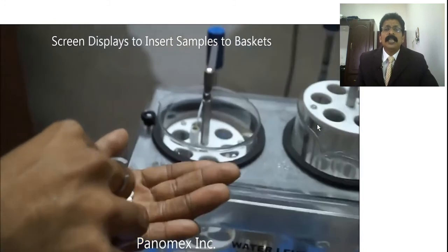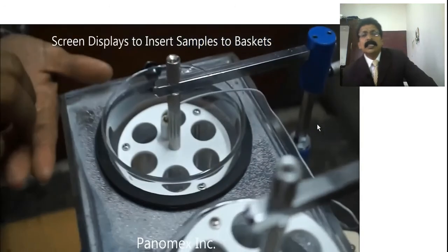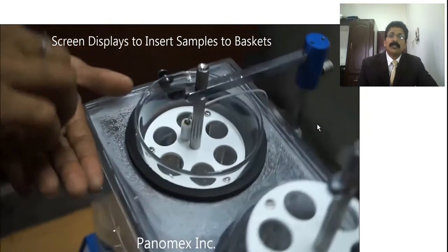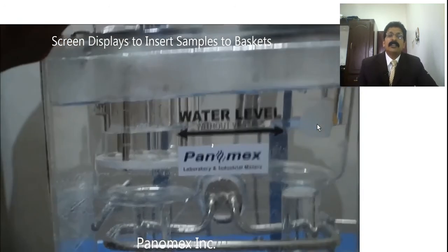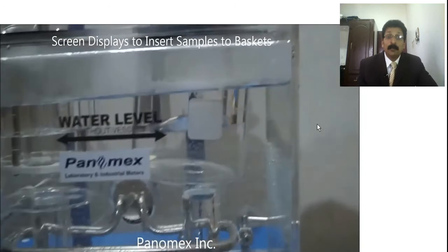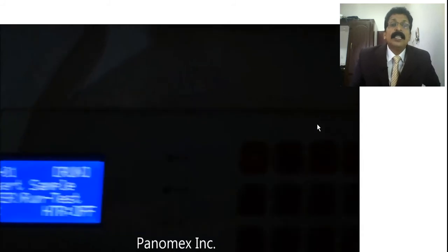I see that the pharmacist is adding the tablets into all the 6 glass tubes, which are open at the top, and the bottom has a sieve or 10 mesh. You can put the tablets inside, and even after putting the tablets, it is necessary to add a plastic disc to increase the abrasion, but here it is not shown.